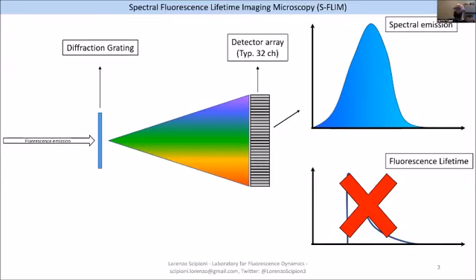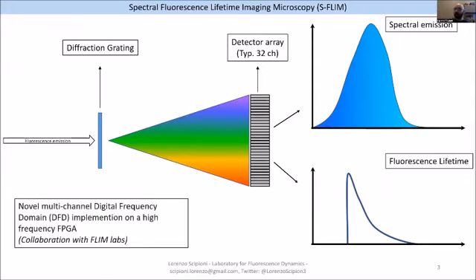What we did was basically taking a detector of this sort and making every one of these detectors capable of acquiring the lifetime information. This was done with the new multi-channel digital frequency domain implementation based on FPGAs that was done in collaboration with FLIM labs.